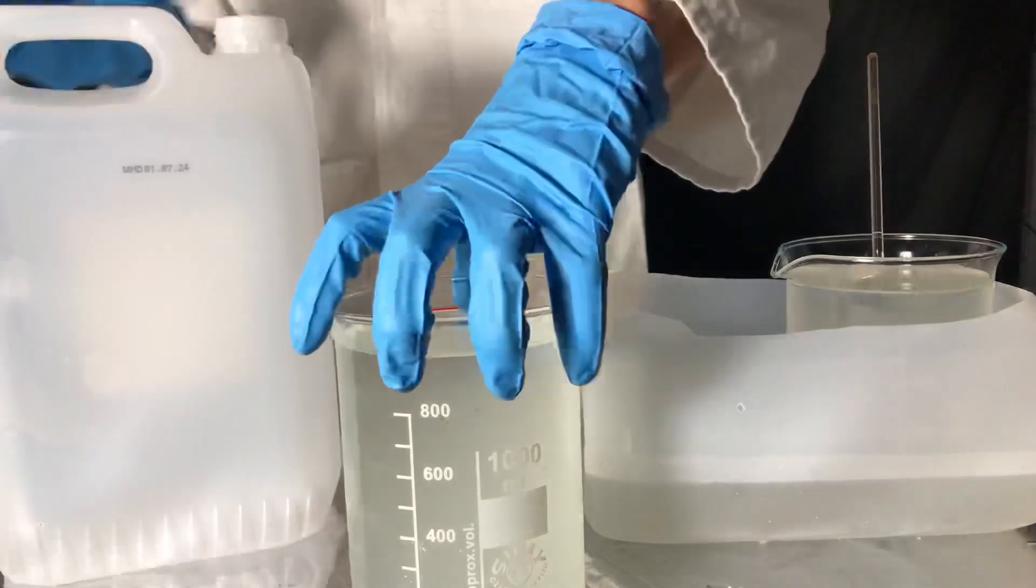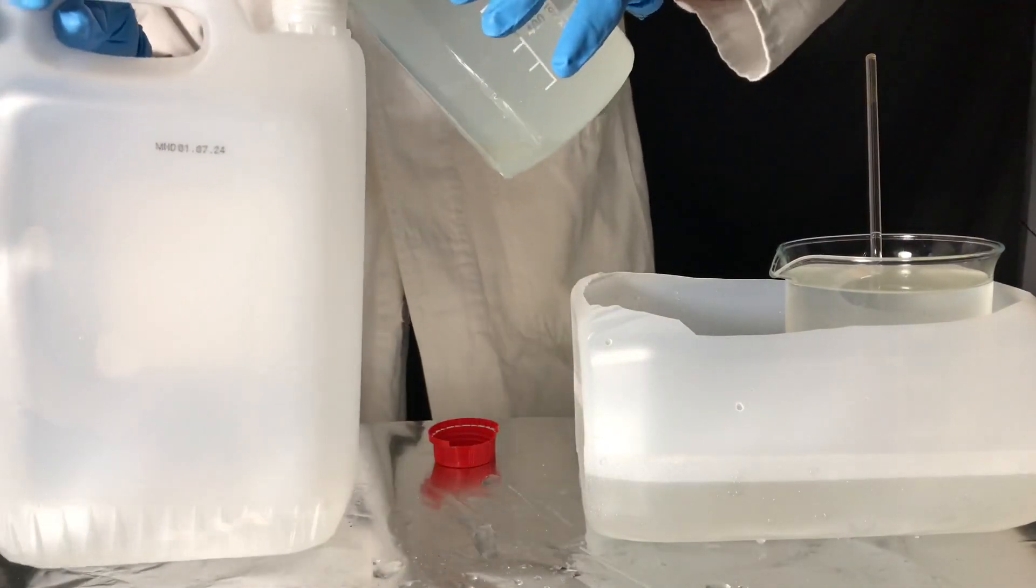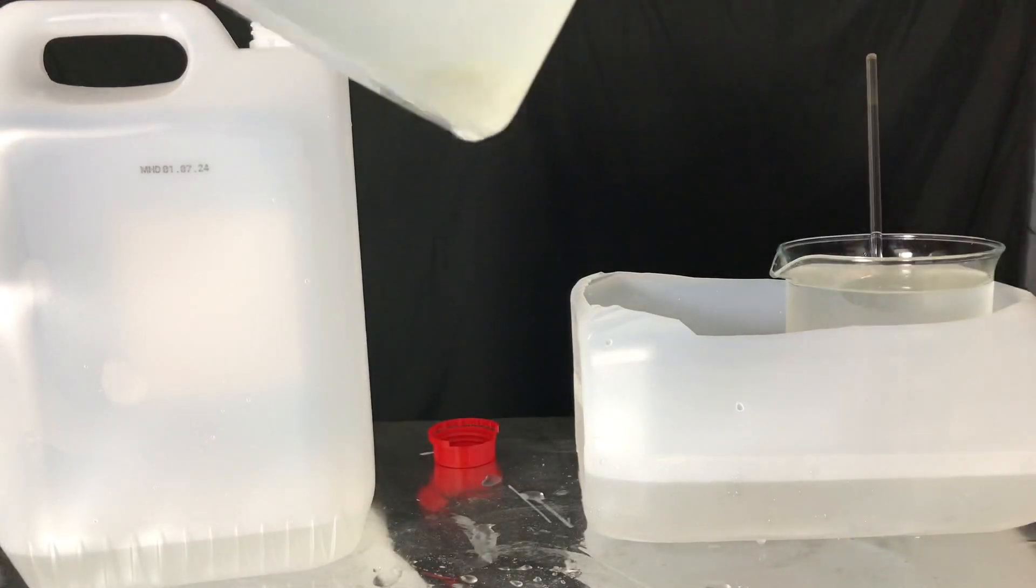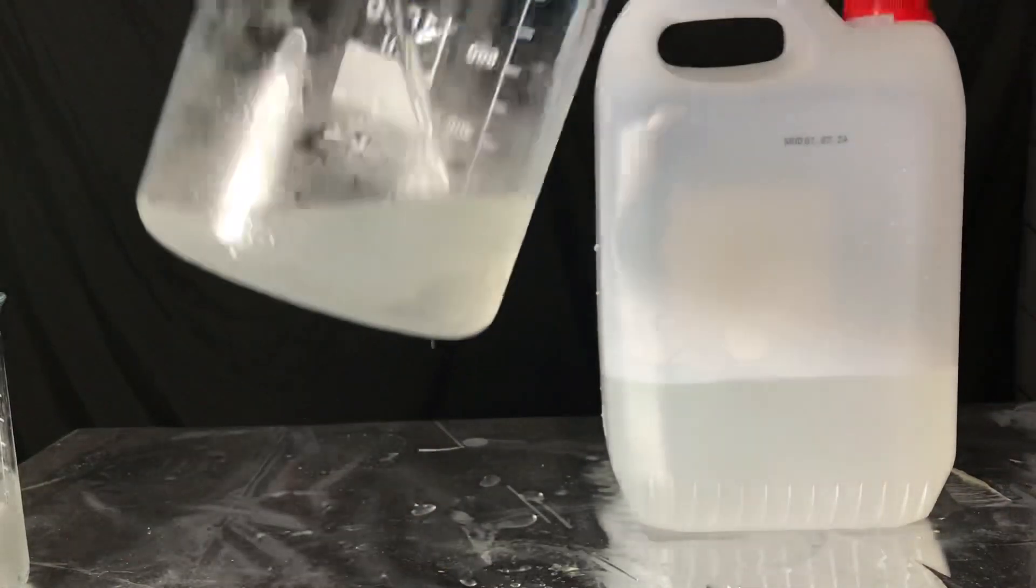The top layer was then decanted off into a canister and we let it stand in the fridge for another day to get even more chloroform out of solution. What you see on the bottom of the beaker is a nice blob of chloroform.